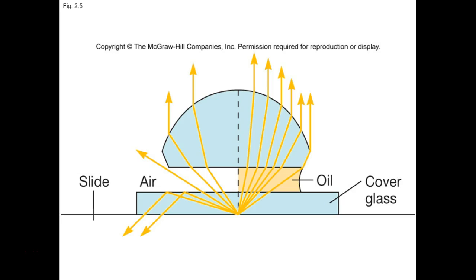Light's important for vision, and it's also a limiting factor for us, because our eyes can only see within the visible light spectrum. You can't see ultraviolet light, can you? No, not unless something fluoresces. Some things you expose to UV light fluoresce, and you can see that because it falls into the visible light spectrum. So there are special fluorescence microscopes that utilize UV light, and those have to have special filters on them because you don't want to damage your eyes either. UV light is damaging. It causes mutation in your DNA.